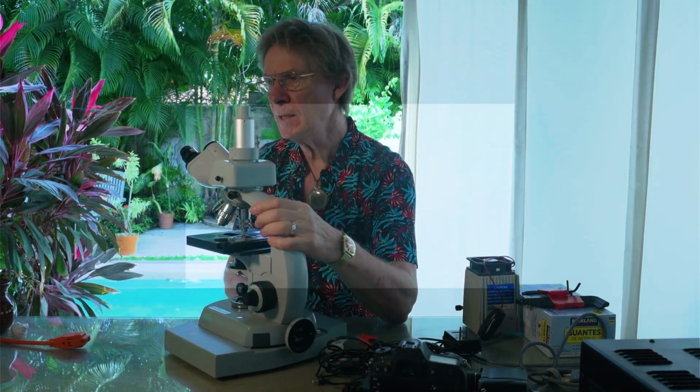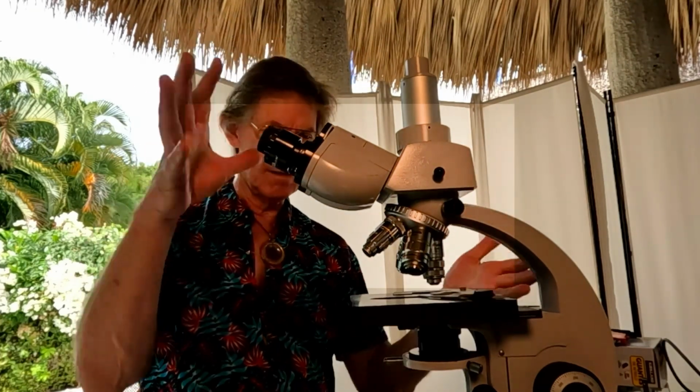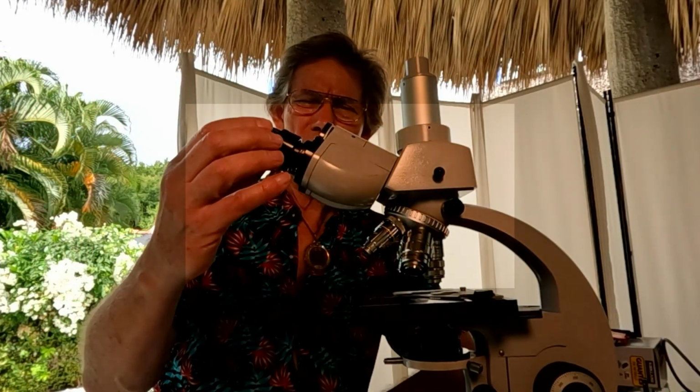So if we look at it here, we can go over here now, we see it's got what a microscope looks like. This is what you would see in a movie. And strangely enough, these microscopes are frequently used as props in movies, whether they're medical or science movies. And that's a good thing. So we have the eyepieces here, which I'm adjusting a little bit.